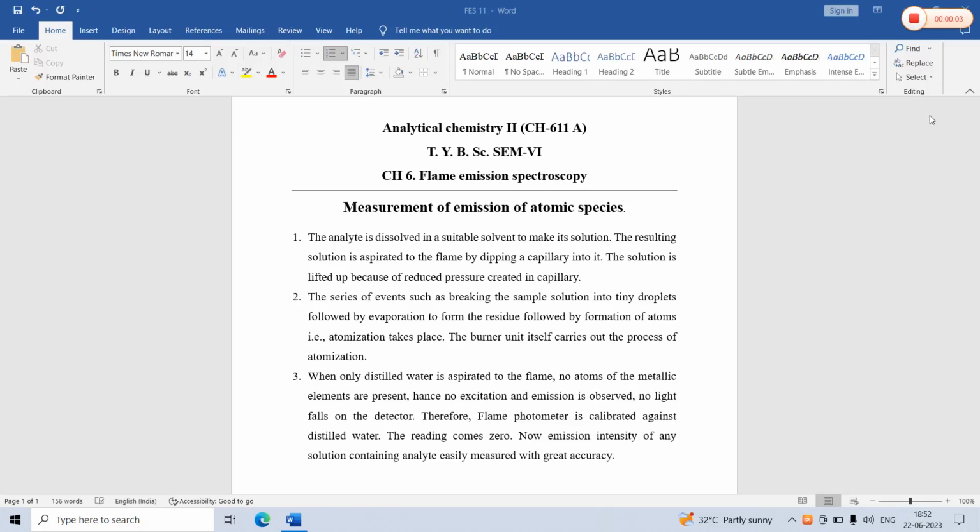Good morning everyone. This is a series of lectures for T.Y.B.Sc Analytical Chemistry students, semester 6. The course is CH611A and the chapter we are going to study is chapter number 6, flame emission spectroscopy. In this lecture we are going to study measurement of emission of atomic species.